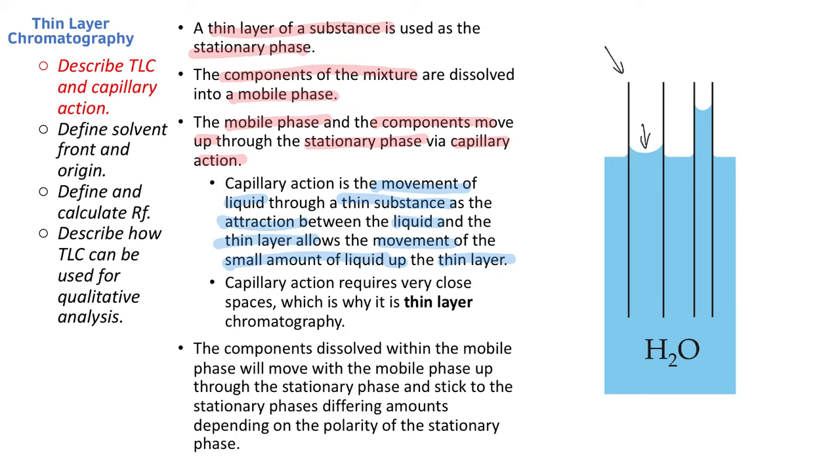All right. The idea is that when this tube gets smaller, more of those water particles can climb up on top of each other, and climb up on top of each other. And then if you get it skinny enough, this continues to move up, up, up, and they continue to rise all the way up this tube, okay?